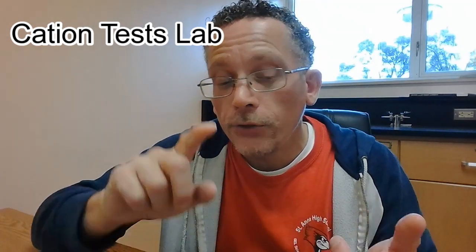All right, so there you go. We have performed some different tests to try to identify some different cations. We identified copper 2 and nickel 2. We identified iron 2 and iron 3, and calcium and zinc. So until next time, take it easy.